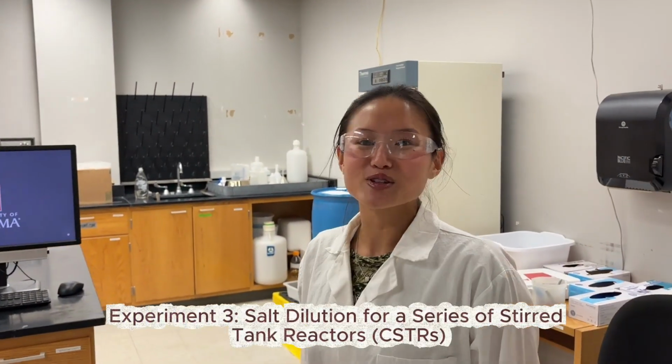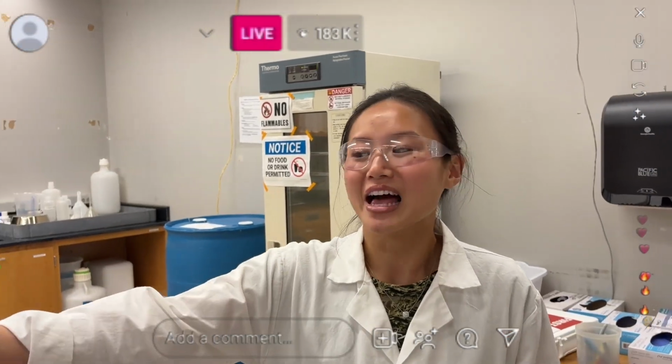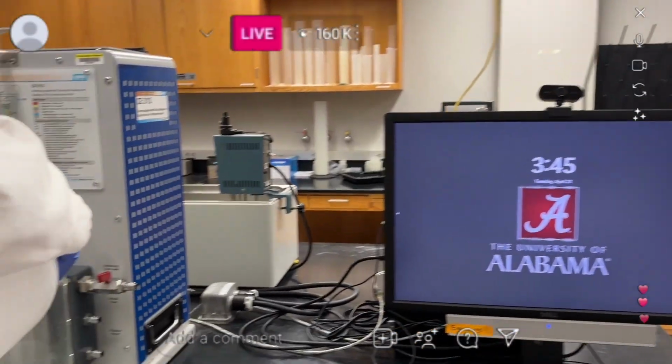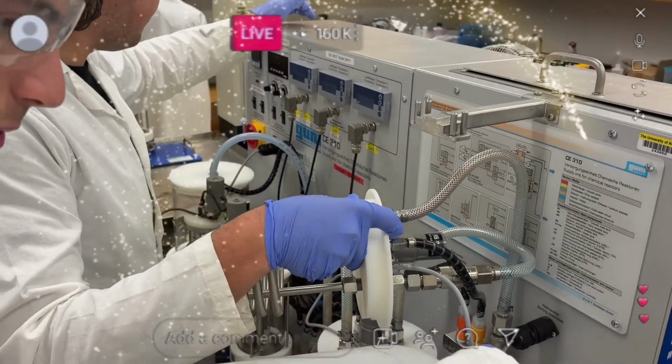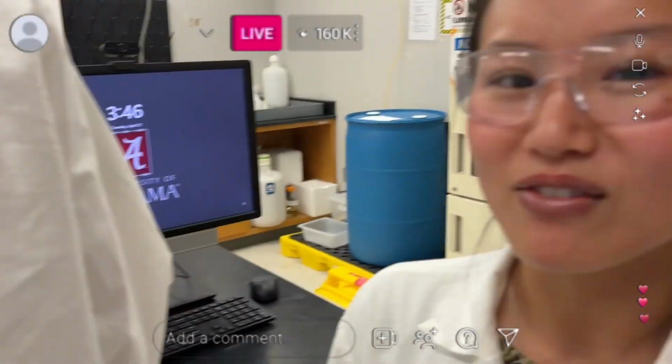Come with me for experiment 3. This is salt dilution through a series of continuous stirred tank reactors, or CSTR. For this experiment, you will fill every CSTR with the water, DI water. Make sure somebody knows what every switch does.